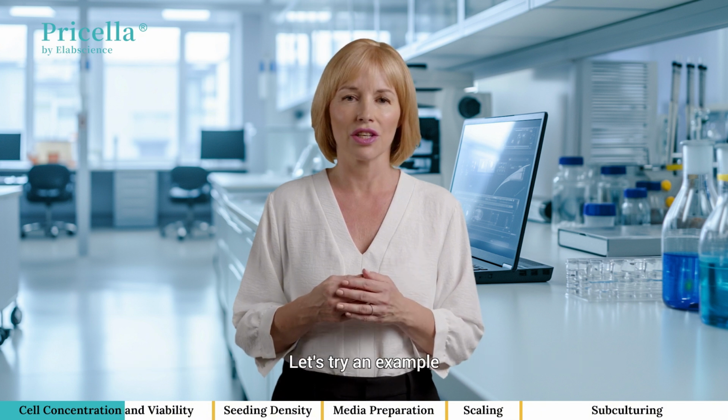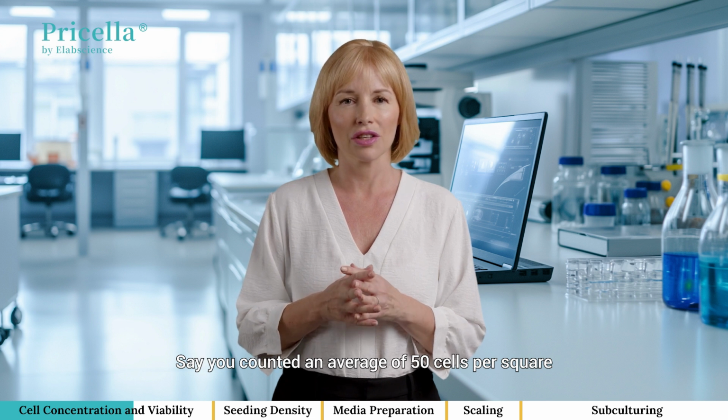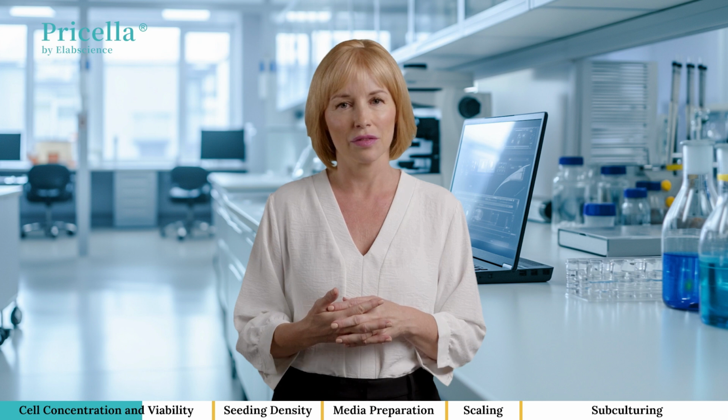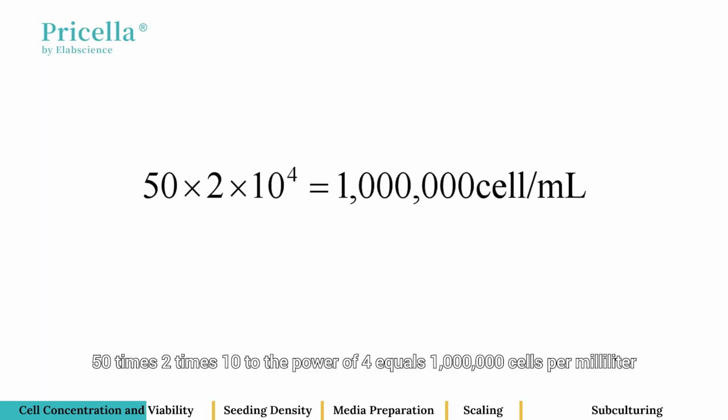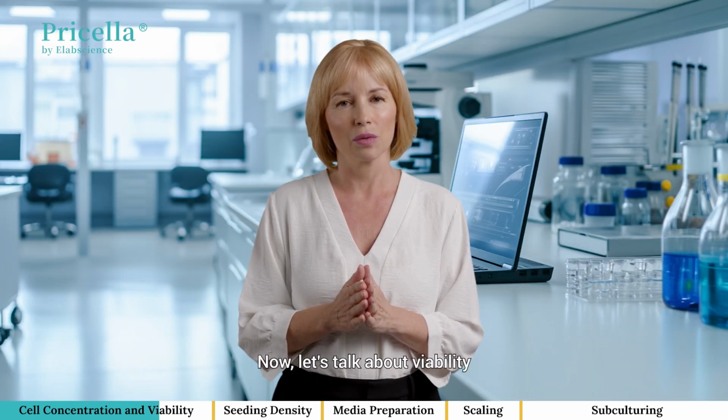Easy, right? Let's try an example. Say you counted an average of 50 cells per square, and you diluted your sample 1 to 2. Plugging into the formula, 50 times 2 times 10 to the power of 4 equals 1 million cells per milliliter. Pretty straightforward. Now let's talk about viability.